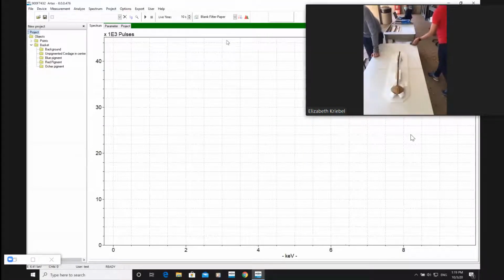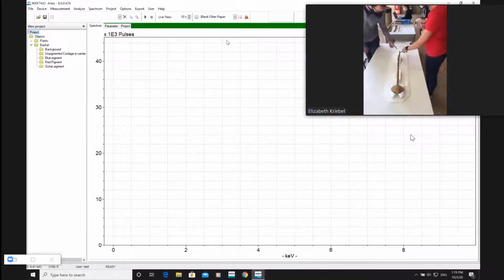All right. So here, the good news is we don't really have to worry about a background because this is going to be about as thick as we can measure everywhere. And if we do have a background, it's going to be styrofoam. So I think we're good. What I would like to start with is the shaft, if that's all right, Dr. Hamilton. So there's sort of a naked shaft, and then there's like a grip. Yeah. I would do the naked shaft first, and then let's look at the grip.